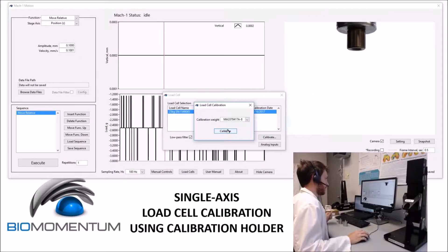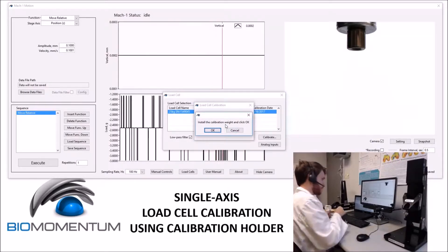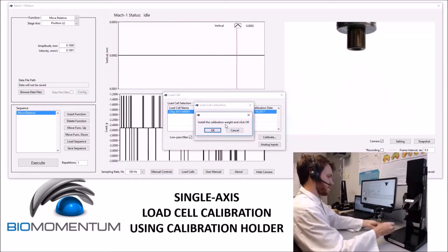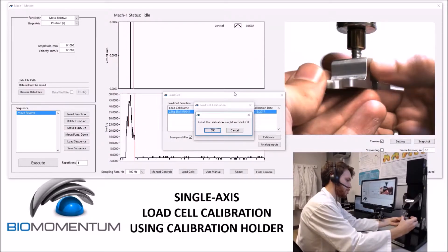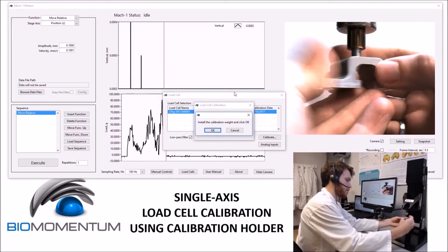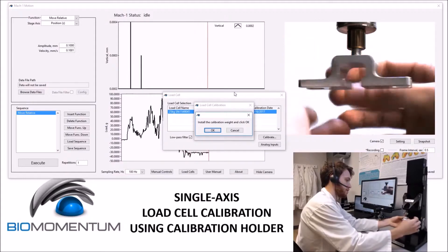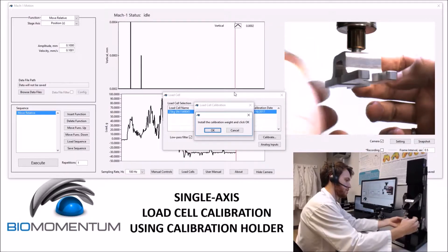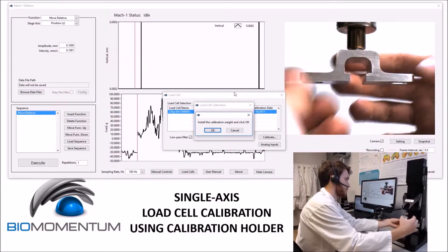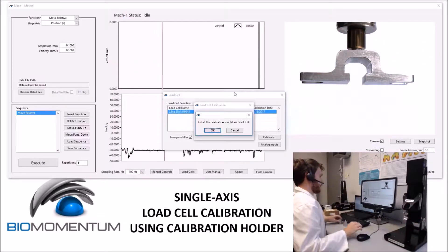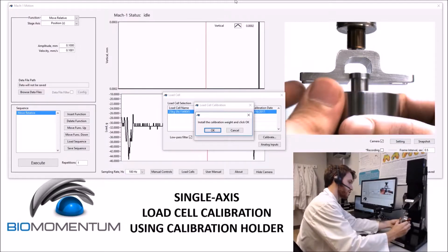For this method, I will click the calibrate button and then follow the instructions on screen. I will first install the calibration holder, being careful not to overload the load cell, and then place the calibration weight into the middle portion.